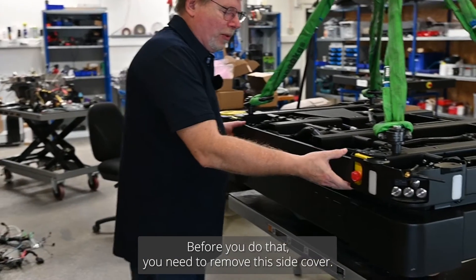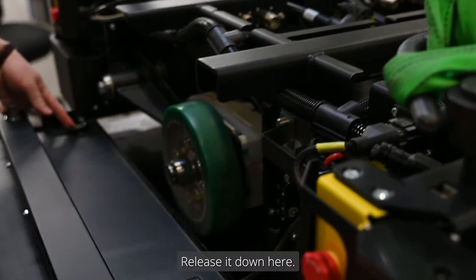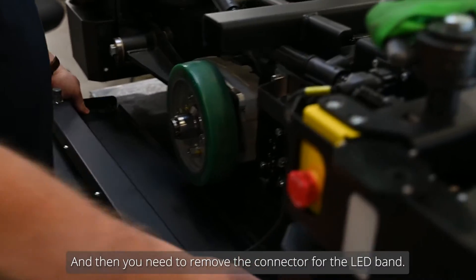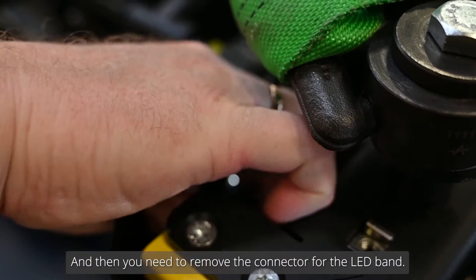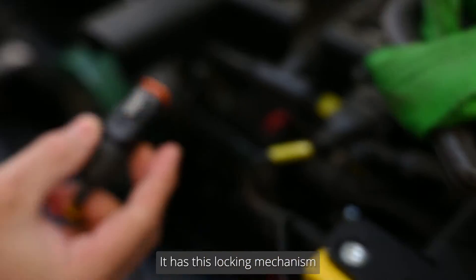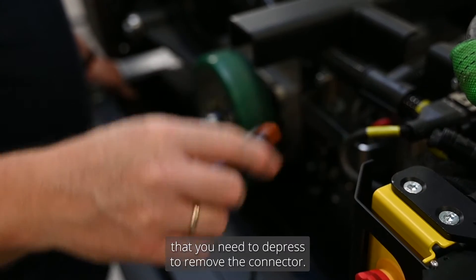Before you do that, you need to remove this side cover. Just open it, release it down here, and then you need to remove the switch or the connector for the LED band. It has a locking mechanism that you need to depress to actually remove it.